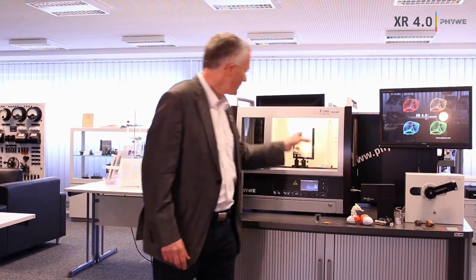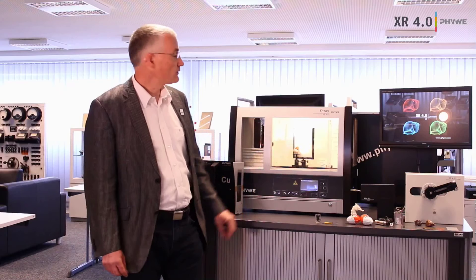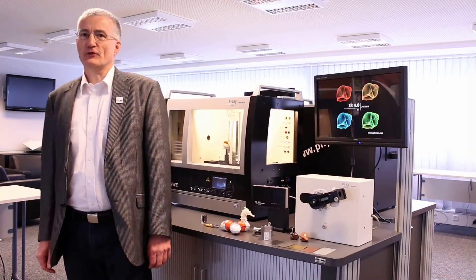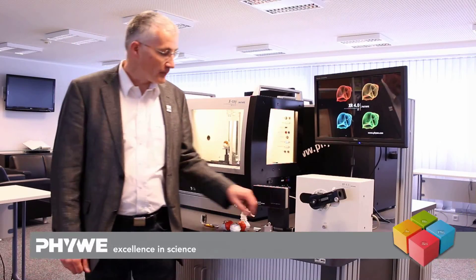The fluorescent screen which you see here can be easily taken out and replaced by another fluorescent screen. But we have other things as well — we have different types of detectors.